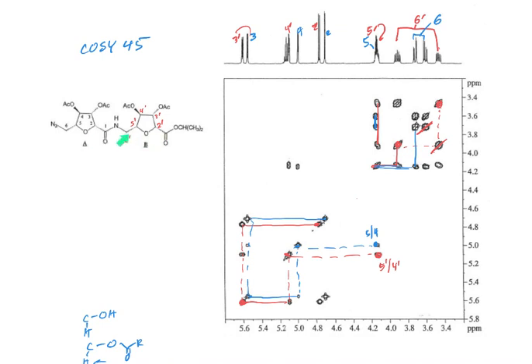It must be, it looked like the stereochemistry around the ring is the same. But you remember that if this is a vicinal coupling, if somehow it's getting bent closer to 90 degrees, then there won't be very good coupling. So there may be an angle dependence there.